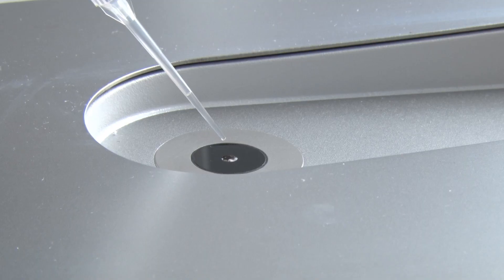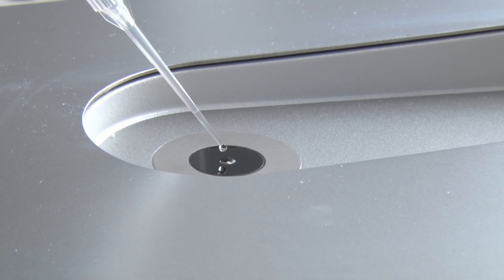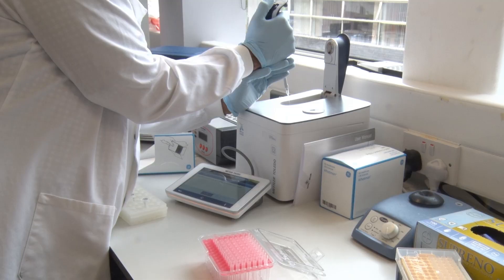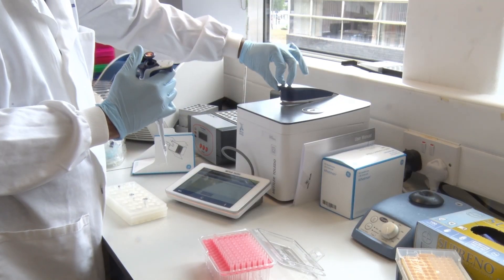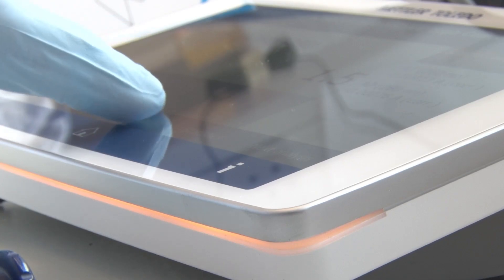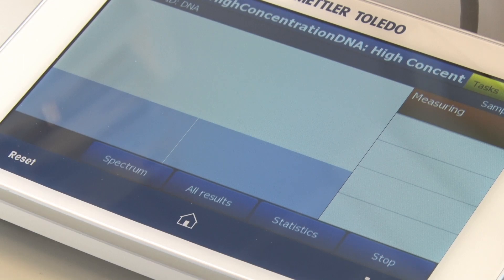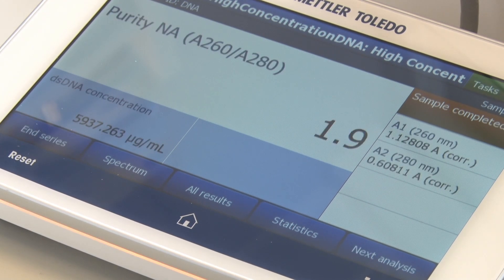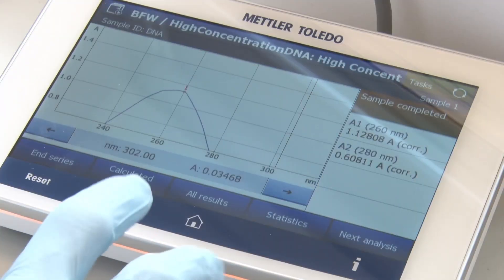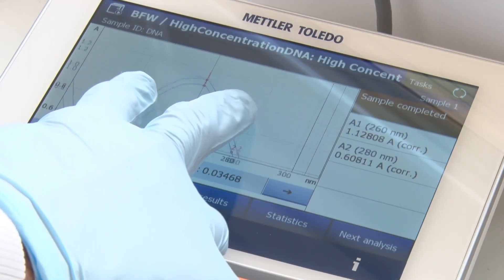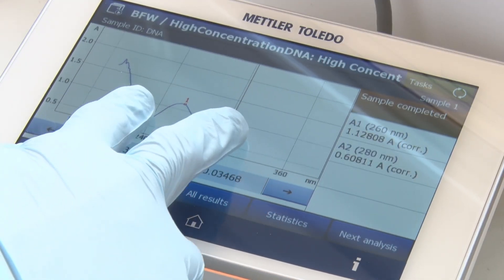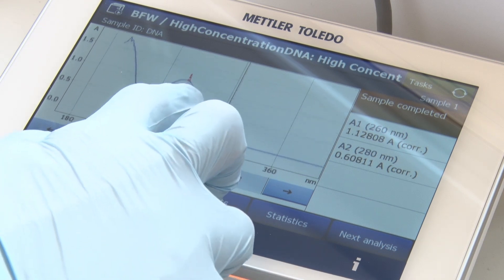It's very accurate and reproducible, and it does everything that we want it to do without requiring us to have it hooked up to a computer, which gives us the flexibility of being able to put it wherever we want in the lab. Previously we were using two separate pieces of equipment to basically achieve the same kind of readings that we can get from this one piece of equipment.